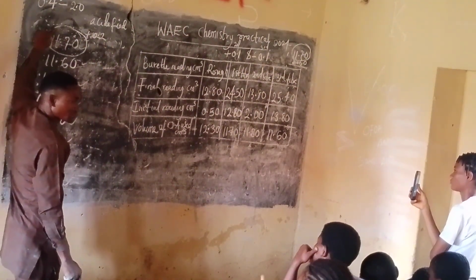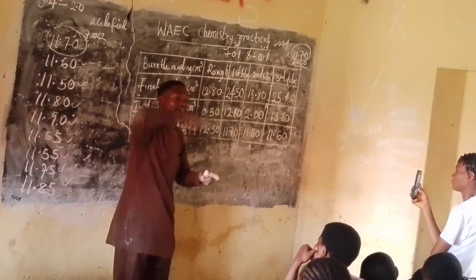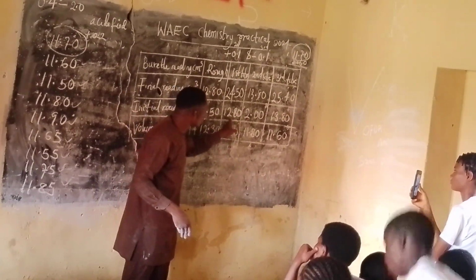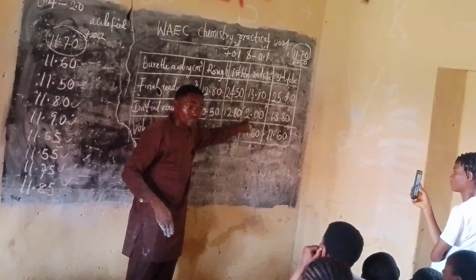Are you there? You can start with any values here, but make sure it's not more. Immediately you get to half of the period, refill, start all over again. You can refill to these values. I can decide to start with 5 here. Are you with me?